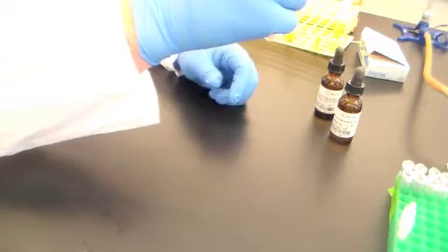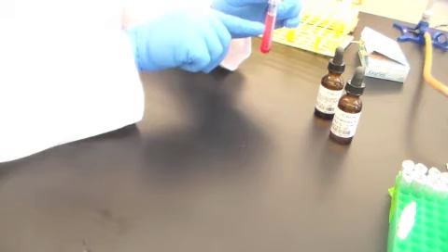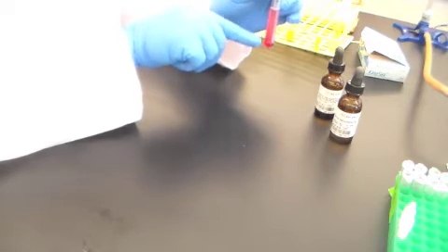So we are beginning to see some pink color here. So this is not the outcome that I had hoped for. This suggests that as these soil bacteria have grown in here, they have reduced nitrate to nitrite, and they haven't yet, if they're ever able to, reduced nitrite to another form, such as ammonia, such as nitric oxide, such as atmospheric dinitrogen. So there has been nitrate reduction in here, as evidenced by this red color.